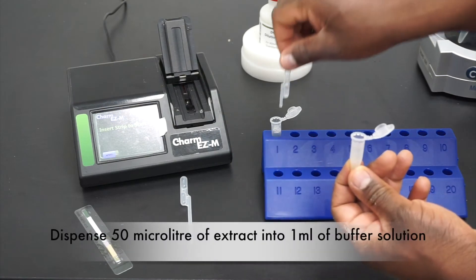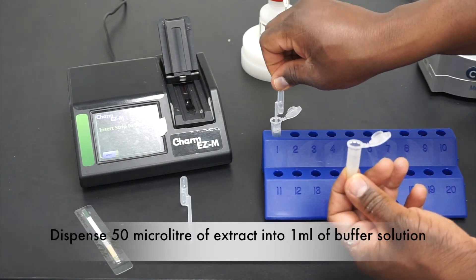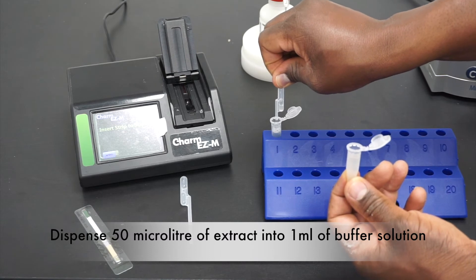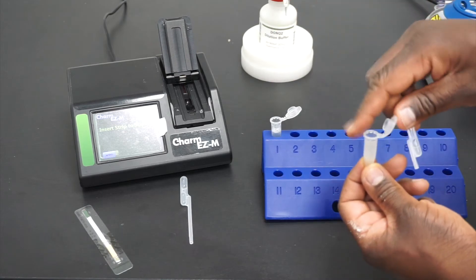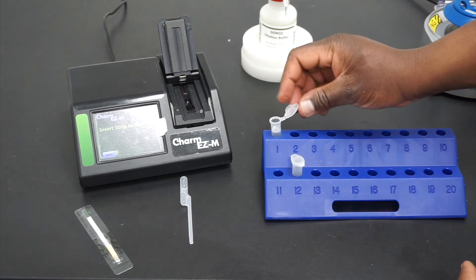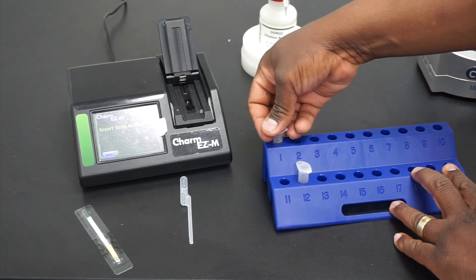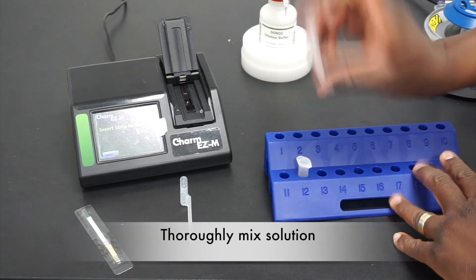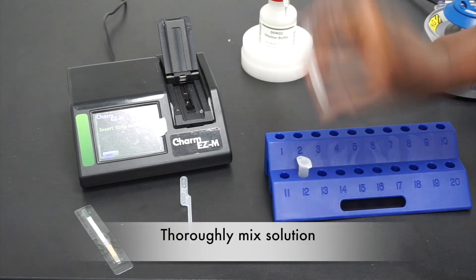Dispense 50 microliters of extract into one milliliter of buffer solution. Thoroughly mix your sample with a vigorous shake.